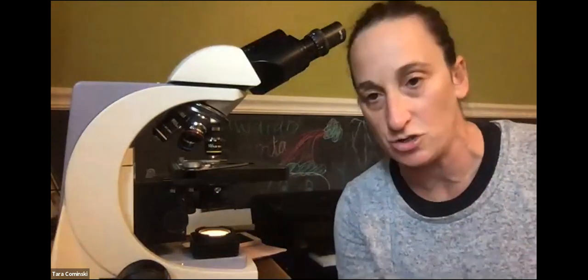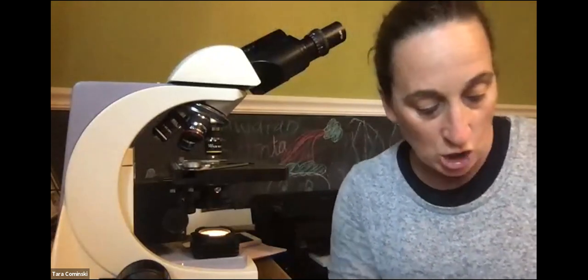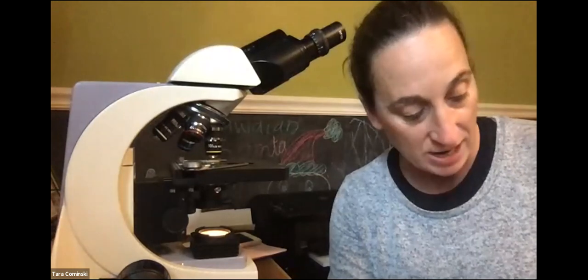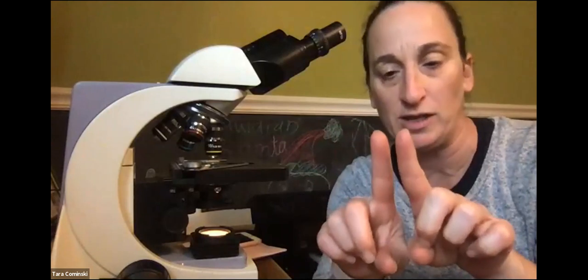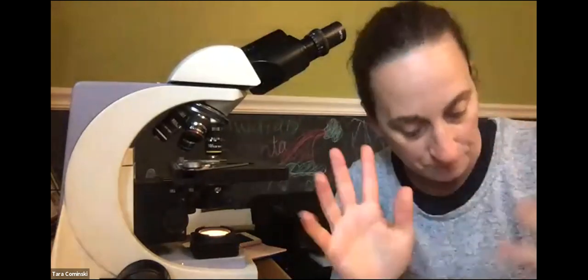It talks about a scanning electron microscope versus a transmission electron microscope. Just know the basic difference, okay? Another term that's introduced in here is something called resolution, okay? So we should know what that is. It's the minimum distance between two objects at which they can still be seen or resolved as two separate things, right? So if resolution isn't good, if you have two objects that are really close together, they may look like one. If it's really good resolution, two objects that are really close together, you'll still be able to see them as two, okay? All right.